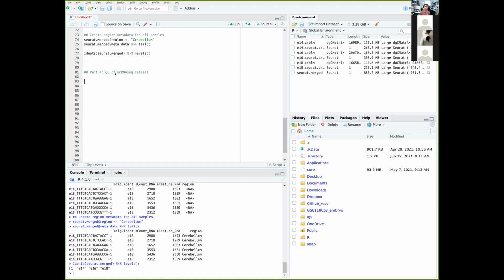And this is, I guess, a very common proxy for viability right now, because the percentage of mitochondrial genes does correlate with the status of the cell. If you have too high a percentage of mitochondrial genes, it could either mean that the cell is under stress, so the number of mitochondrial genes rise up, or the overall transcriptome is downregulated or degraded, and the mitochondrial gene percentage is now slightly higher.